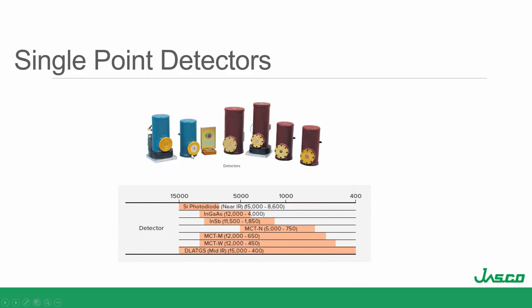These are some of the detectors that are possible with an IR microscope. We have a photodiode for near IR, then the room temperature detector, and then the MCT wideband is here. It goes from 450 to 12,000, and that's really good enough for most applications. The MCT detector is about 100 times more sensitive, or a few orders of magnitude more sensitive, than the DTGS.